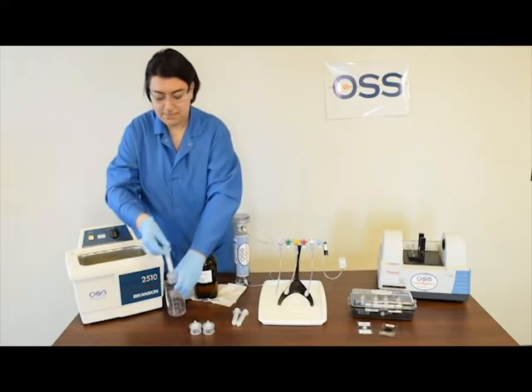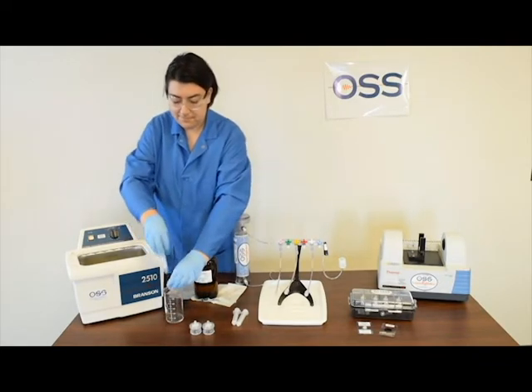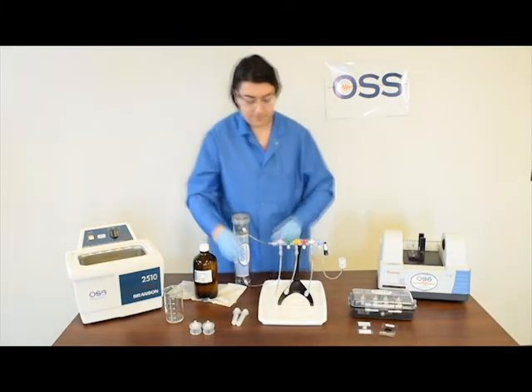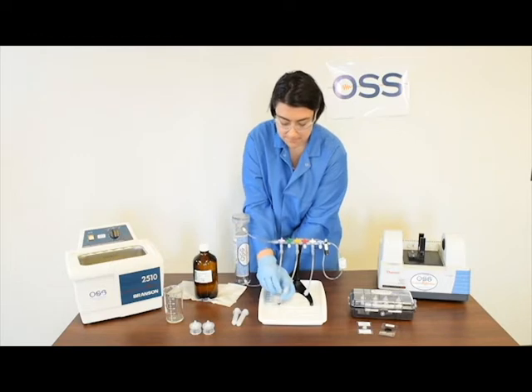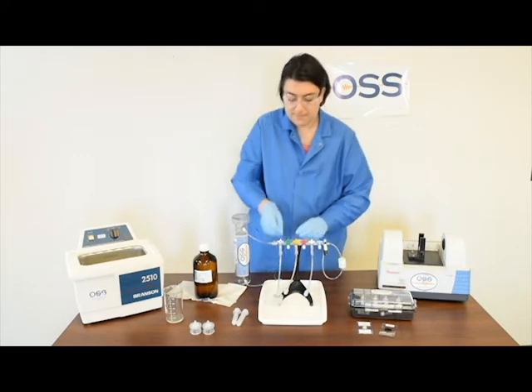The extractor is then dried using OSS's drying system, which flows pressurized, oil-free, dry air through the extractor, and is then analyzed in an FTIR instrument.